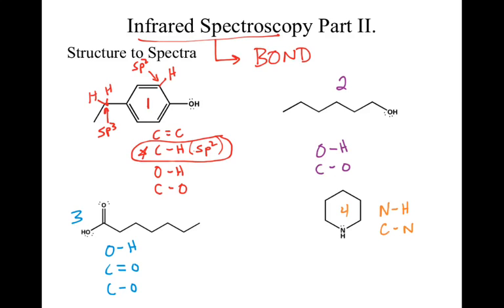Other things that we could try and look for. You'll notice that OHs show up in 3 of these. Okay, so the OH, while it's a nice characteristic bond, 3 of them have it, so that's not the easiest thing to pick out in the IR because all 3 have it. But we could go through and say that our NH was different from that. Okay, well, the NH is different from that, but if we look up the NH bond in your table of example pictures, the ones that are shown are sharp, but if you read about them, they sometimes say they're broad. We'll talk about that difference in just a little bit.